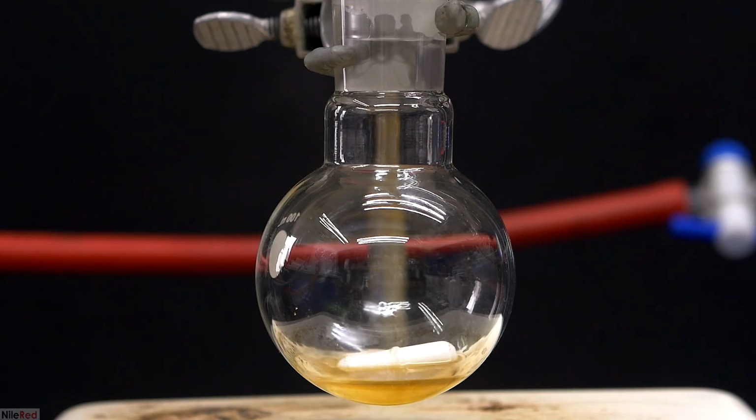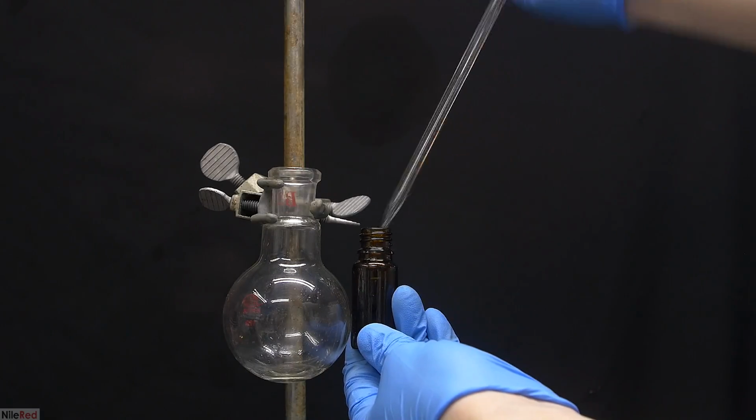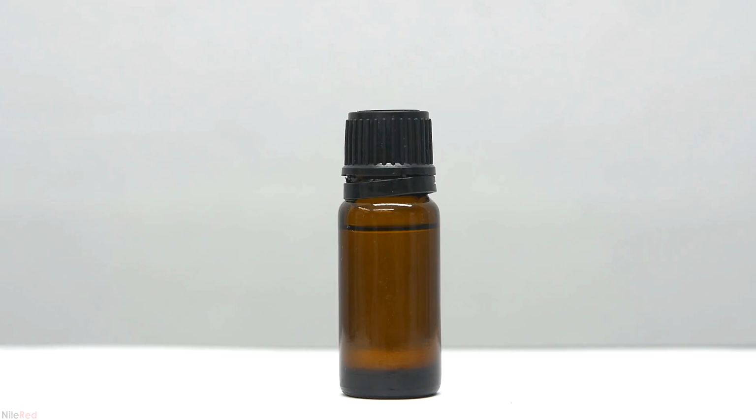At the end, we're left with an orange residue of higher boiling point stuff at the bottom of the distillation flask. In our receiving flask, we're left with an oily liquid, and I transfer this to a small amber glass bottle. The final yield of caproic acid was about 8 grams, which corresponds to a percent yield of around 45%. This is not the best yield, but it's honestly not too terrible either.